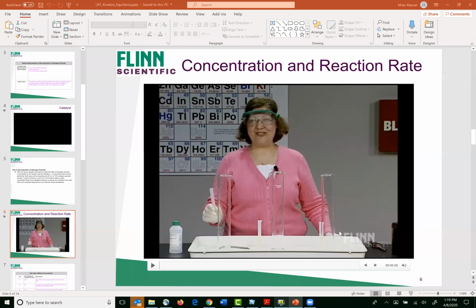Okay. So here, let me add some color to this question before you answer, because we're going to see this example after you answer the question. So let's say we ignite a wood splint, blow it out. Will that wood splint reignite or not upon immersion in the products of hydrogen peroxide decomposition? Is there a byproduct of hydrogen peroxide decomposition that will support combustion? And then we're going to see what the result is.